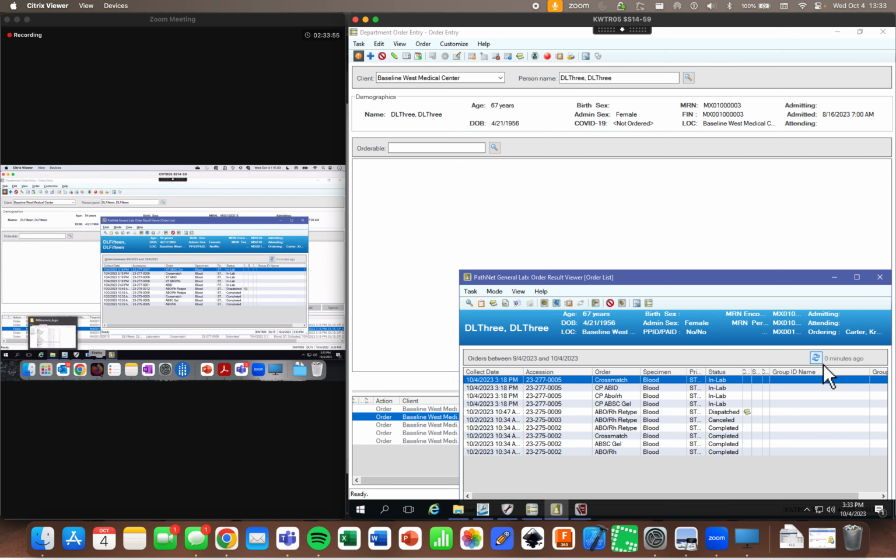Okay, so other than that kind of stuff, any other issues? Where we go ahead and start putting in some results. I think we're going to do a couple of our orders here. Not seeing anything, and I'm not hearing anything on the phone. So our next step is to go to blood bank result entry.